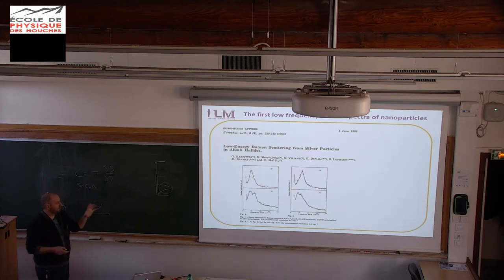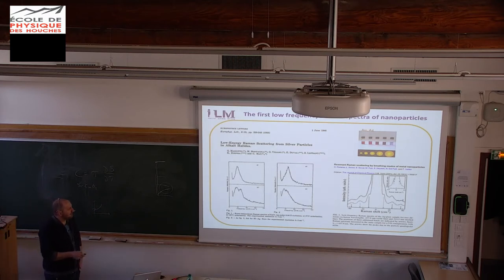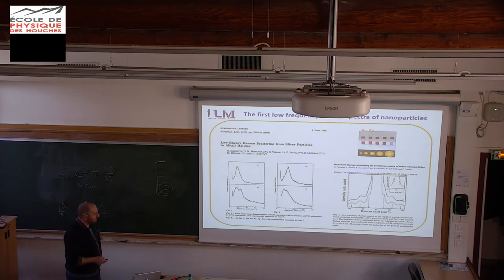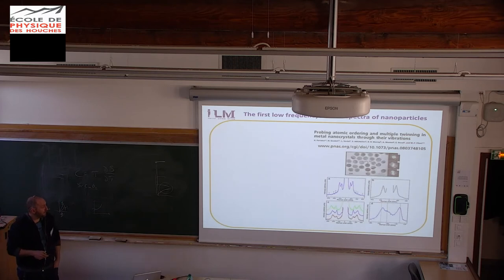So you have really the possibility to check what you are doing with Raman spectroscopy. It's a bit long, but you can do it. And more recently, they also look at this. So in that case, there is a quadrupolar mode at really low frequencies. This is somewhere here. And you are also observing other modes in the case of silver nanoparticles. So in that case, it was a breathing mode. Okay. So that means with that technique, a non-destructive technique, you can determine the size of the object you have really fast. So it's already good information.